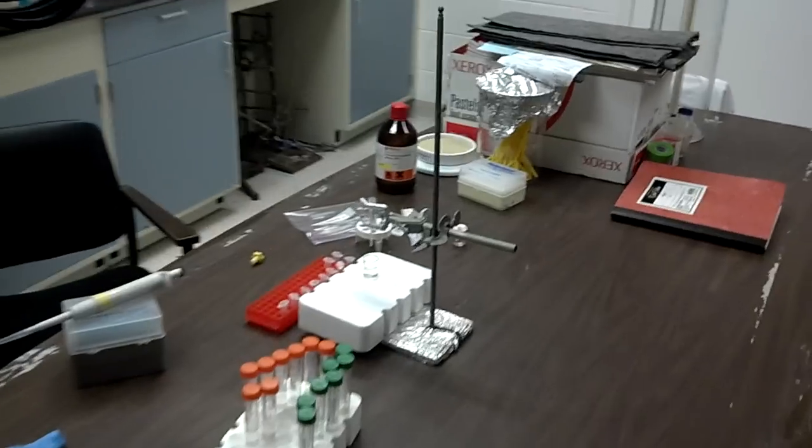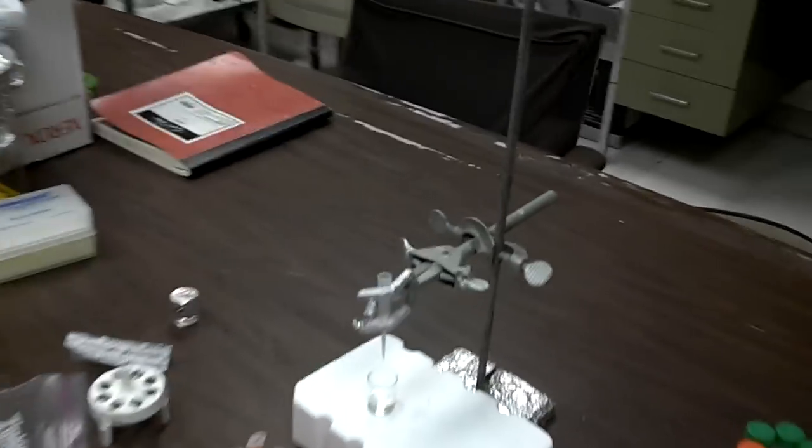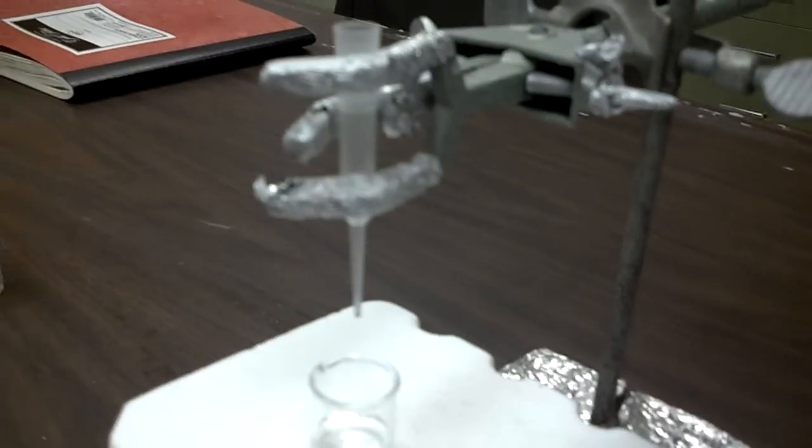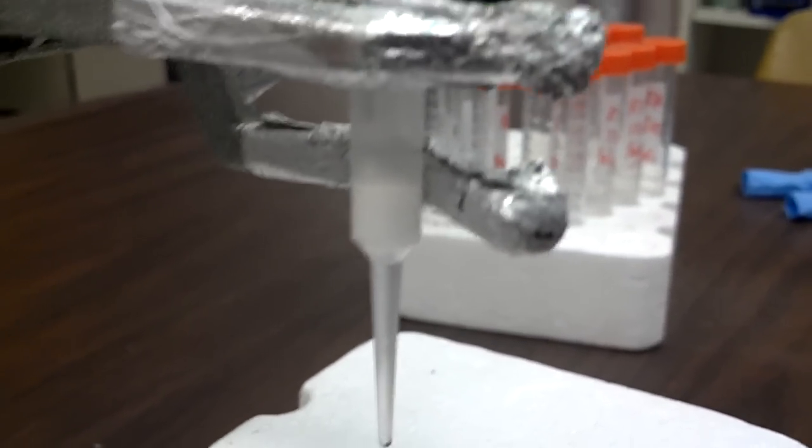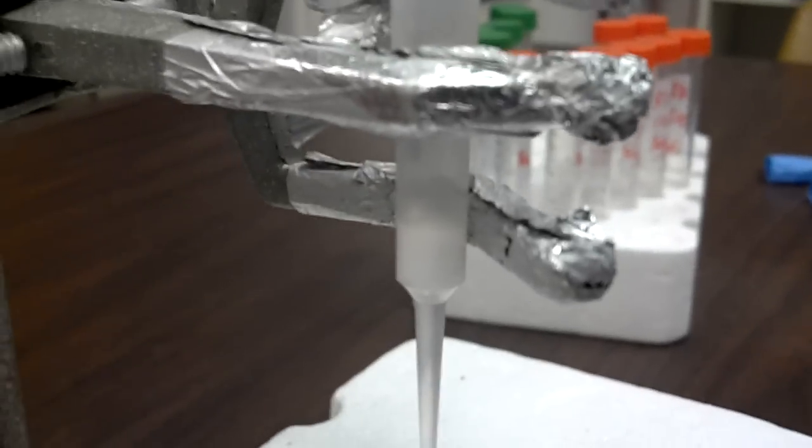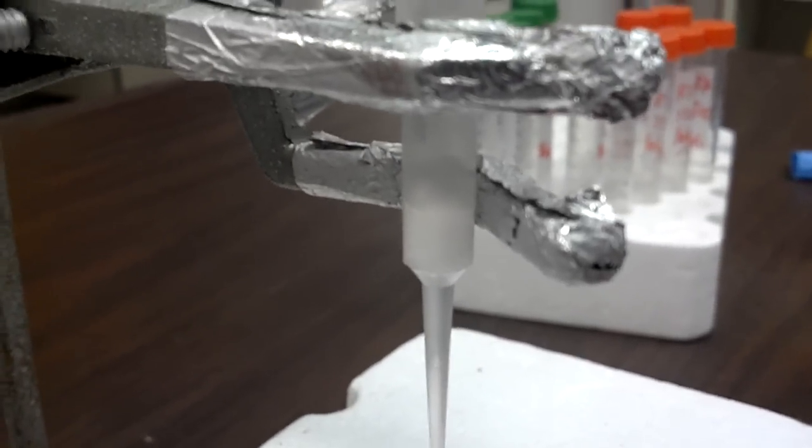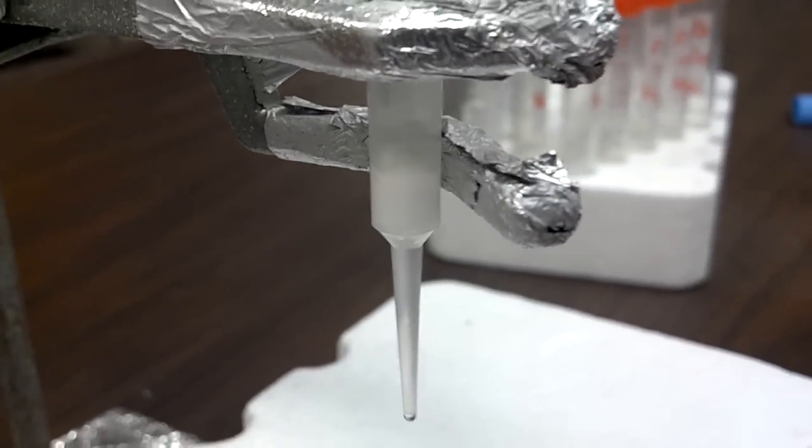This is Xiao Yu's stuff. She's currently running a purification column. This little column right here. Put your stuff in. It binds to that little white place right there. Then you can wash all the shit out. Then you can use a different solution to wash what you want out. And we keep it in that.